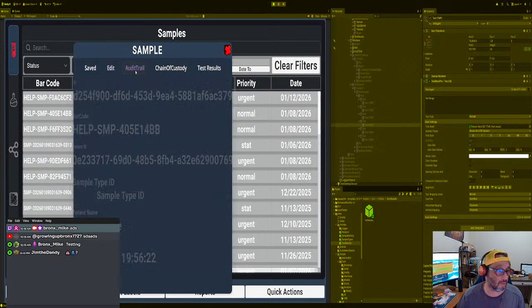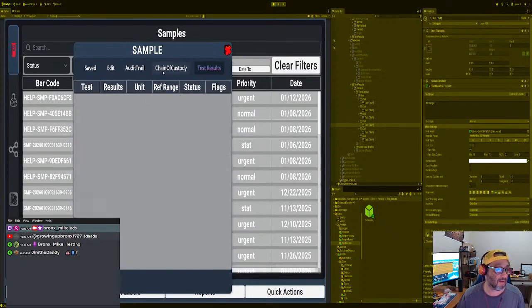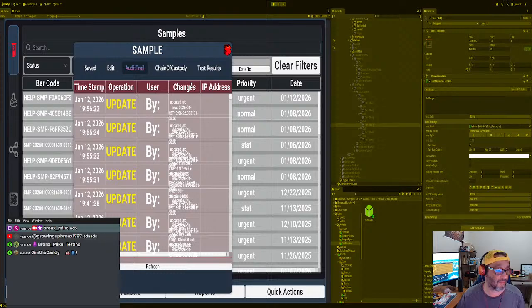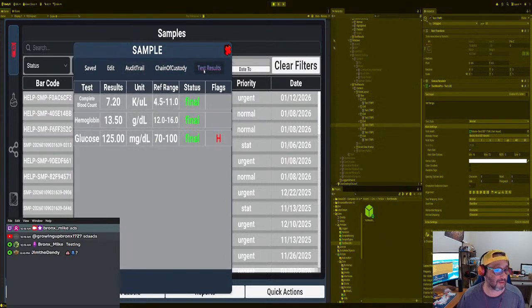Okay, so boom, boom, boom, boom, and you see some of them. Me rushing through, I forgot to capitalize some of them. So like I said, you're going to have to go through some stages. We get the basic code in there, we work out the bugs and all that, and then you probably have a UI person, probably yourself, to make sure everything looks nice and neat and makes sense.